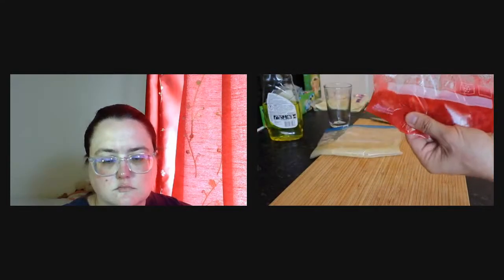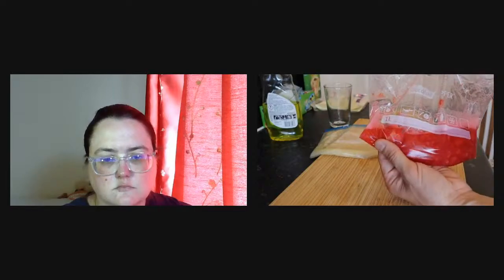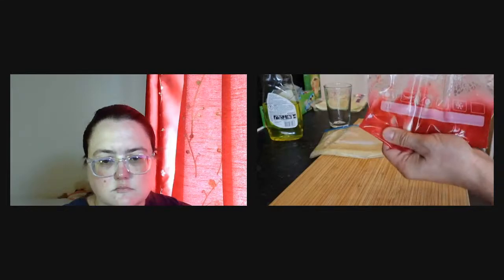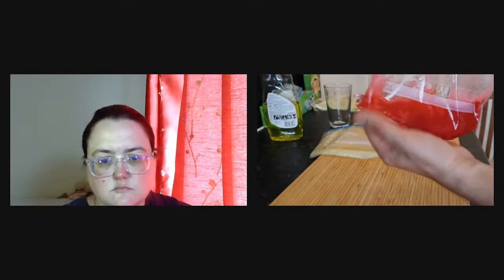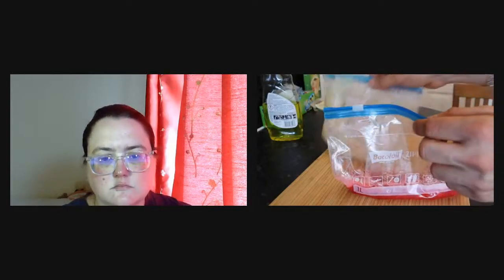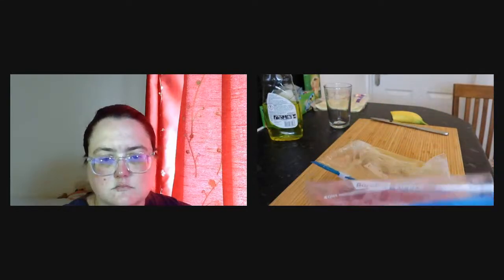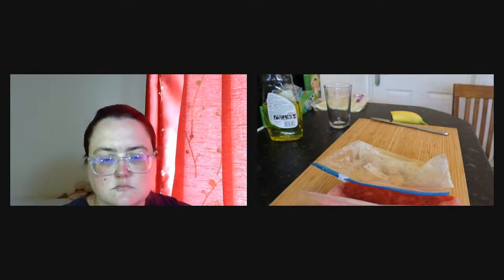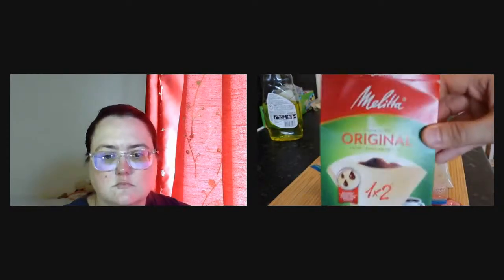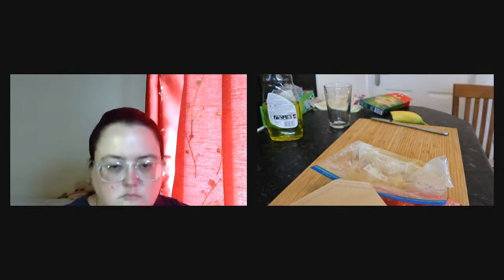Okay, so you can see here, this is for the strawberries, and I still have quite some big debris, cell debris and tissue debris. It's like some of the inner core of the strawberries, a white part that is difficult to break. So we want to remove all of those big debris. So the next step is going to be about this, and we are going to work with some coffee filters. So I just get some coffee filters from the shop. I need two, one for each preparation.